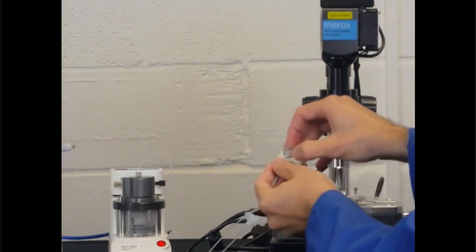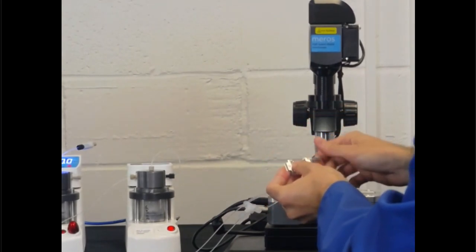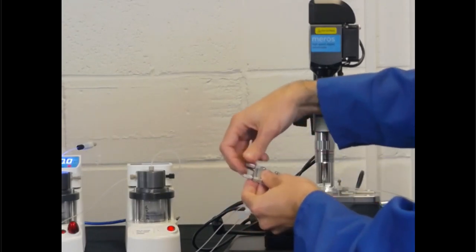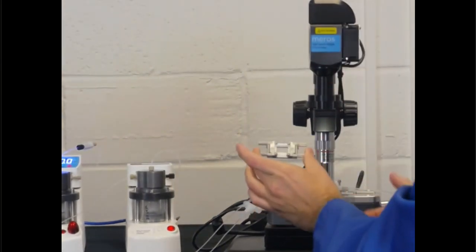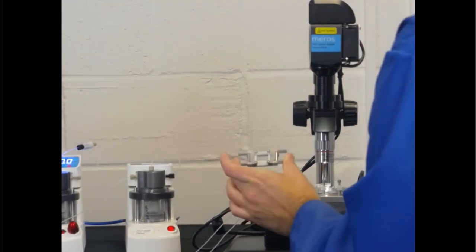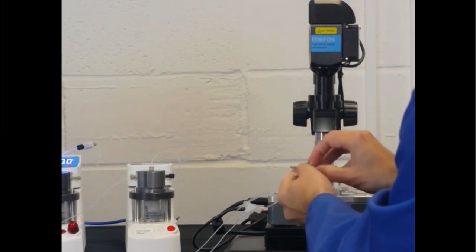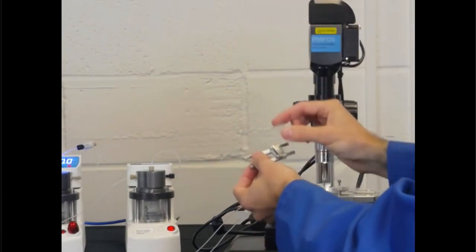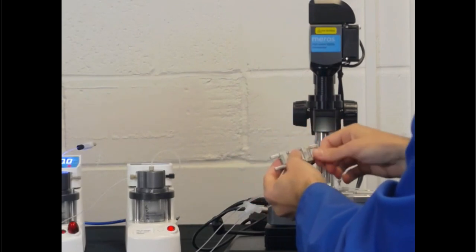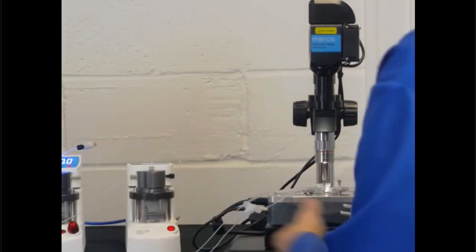The chip is here, and you can plug the chip in the middle of the H interface, and then connect the tubing on the left side, connect the other tubing on the right side, seal everything, and then if those tubings are connected to the pump, you can drive your solution from the pump to the chip in a fluidically sealed system. And if you want to change application or change the chip, you simply unscrew those linear connectors, remove the glass microfluidic device which defines your application, and plug in another one like this one, a droplet generator for instance, for the formation of giant liposomes. You tighten the linear connectors, and then you have basically swapped application.